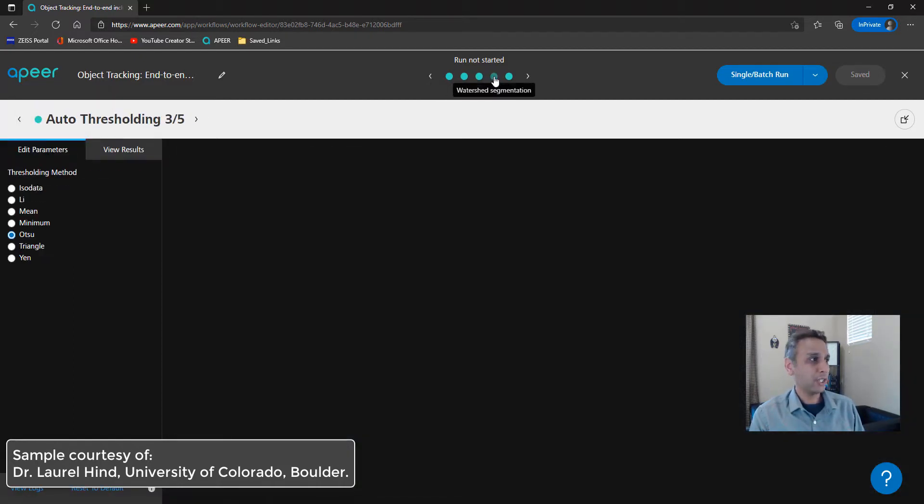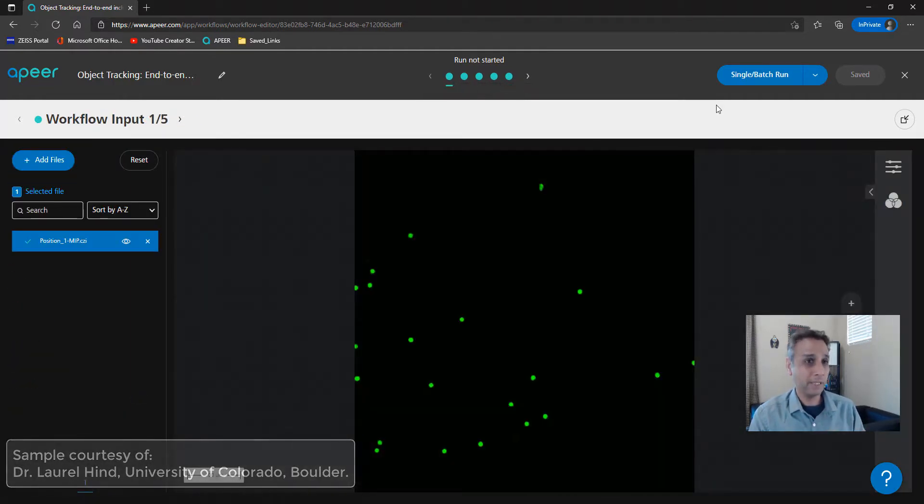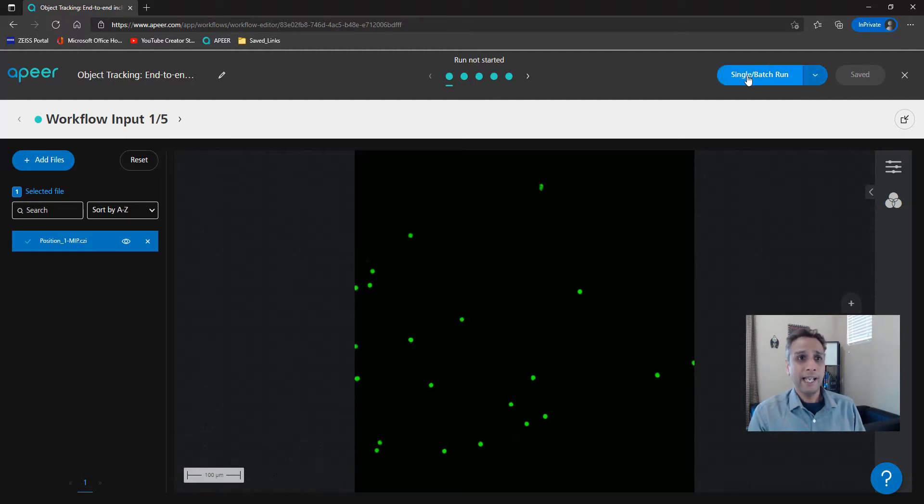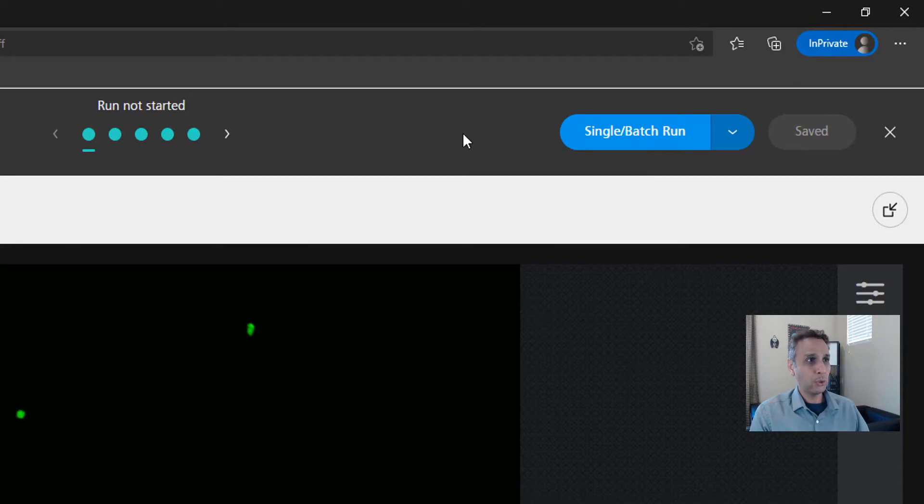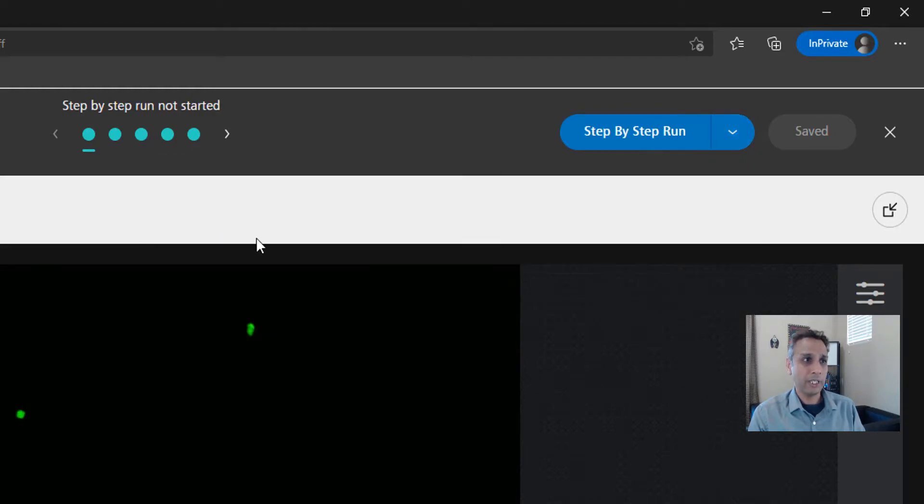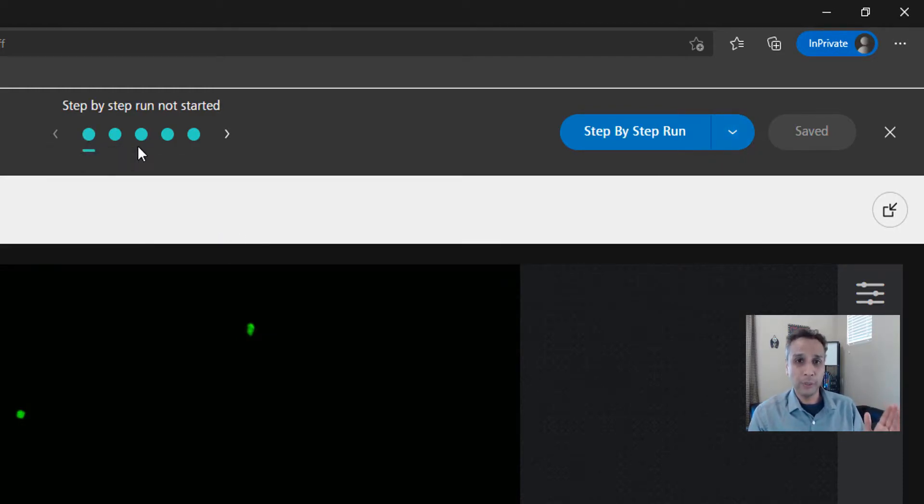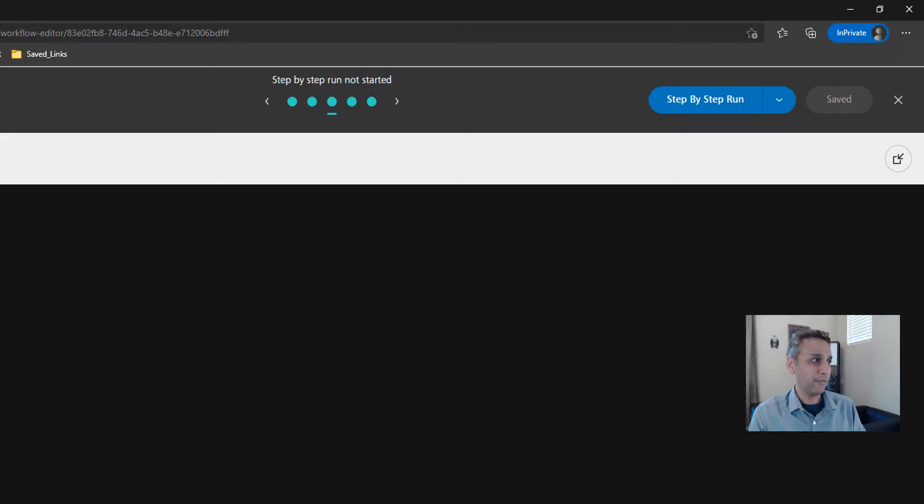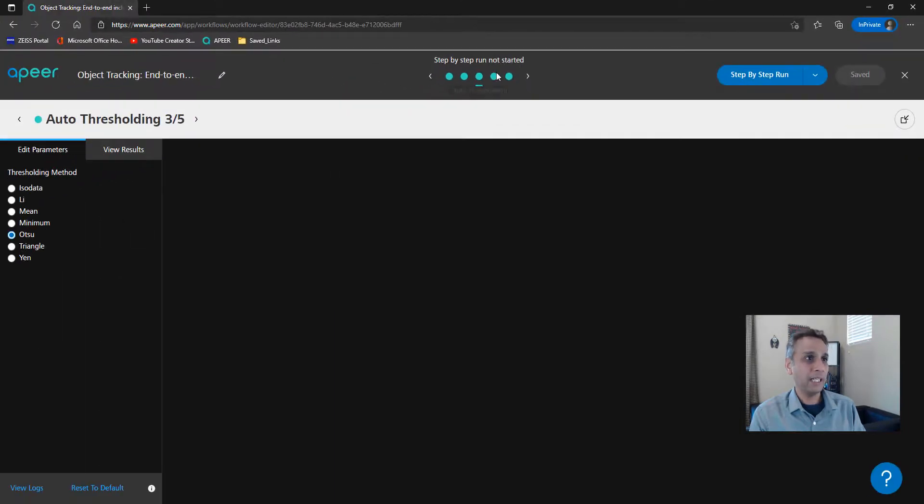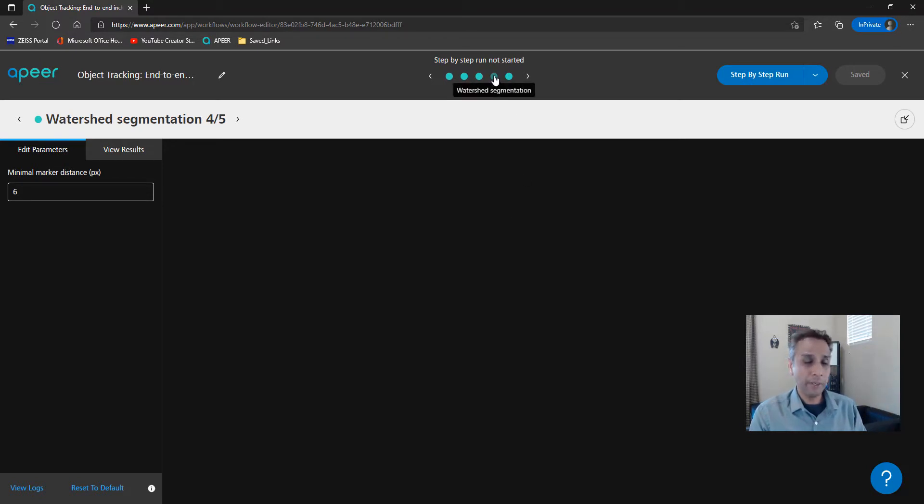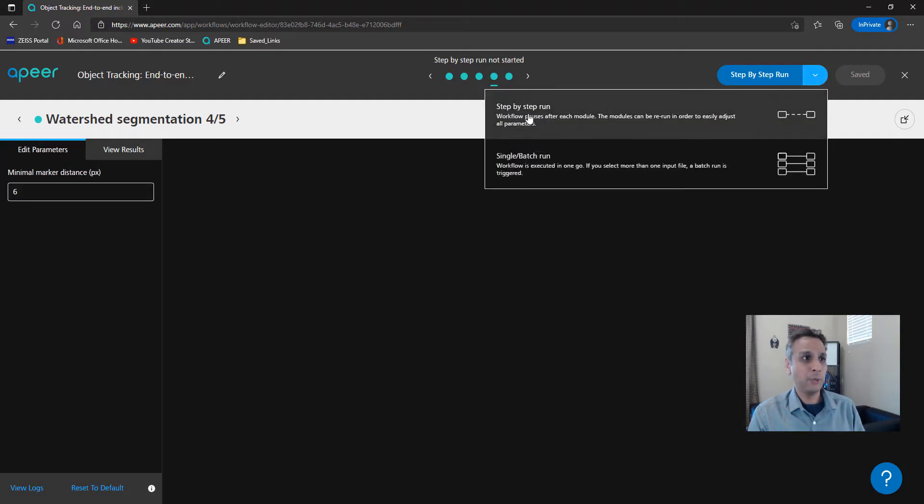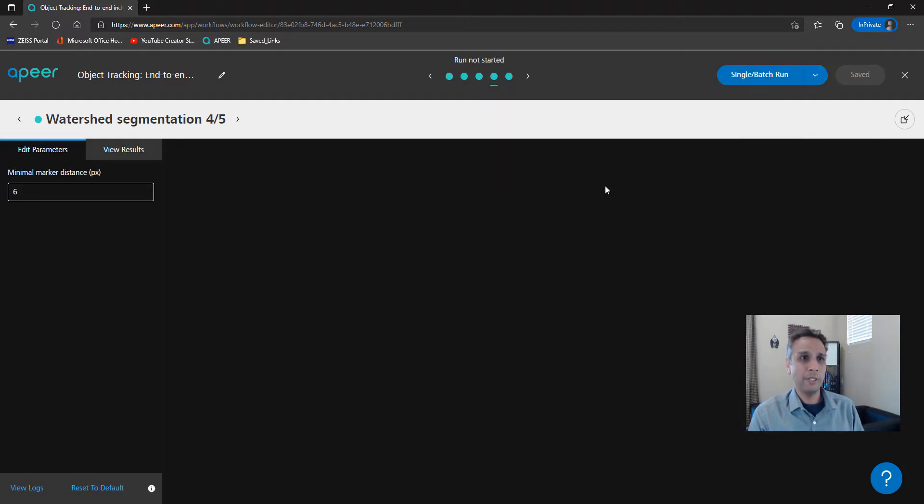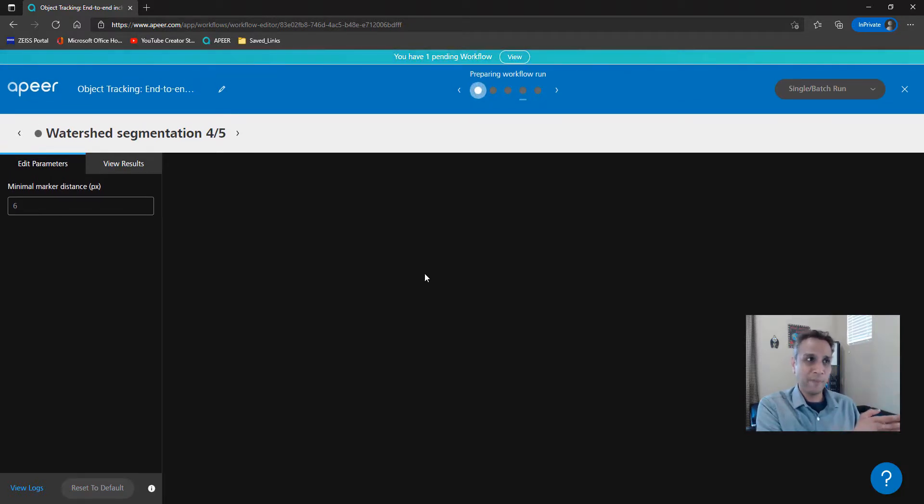Our workflow is ready to be executed. You can click on the single batch run, which goes through all the modules at a time, one after the other, or you can select step-by-step run. After the first module is done, it waits for you to hit next. Why would you like to do that? If you're setting auto-thresholding or watershed segmentation, you'd like to see the result first before you go to the next step. That's when you can stop here and then continue. But if you're working on similar samples over and over again, maybe this setting works. You just need to do single batch run, at which point it starts with the first module, then the second, then the third, and so on.